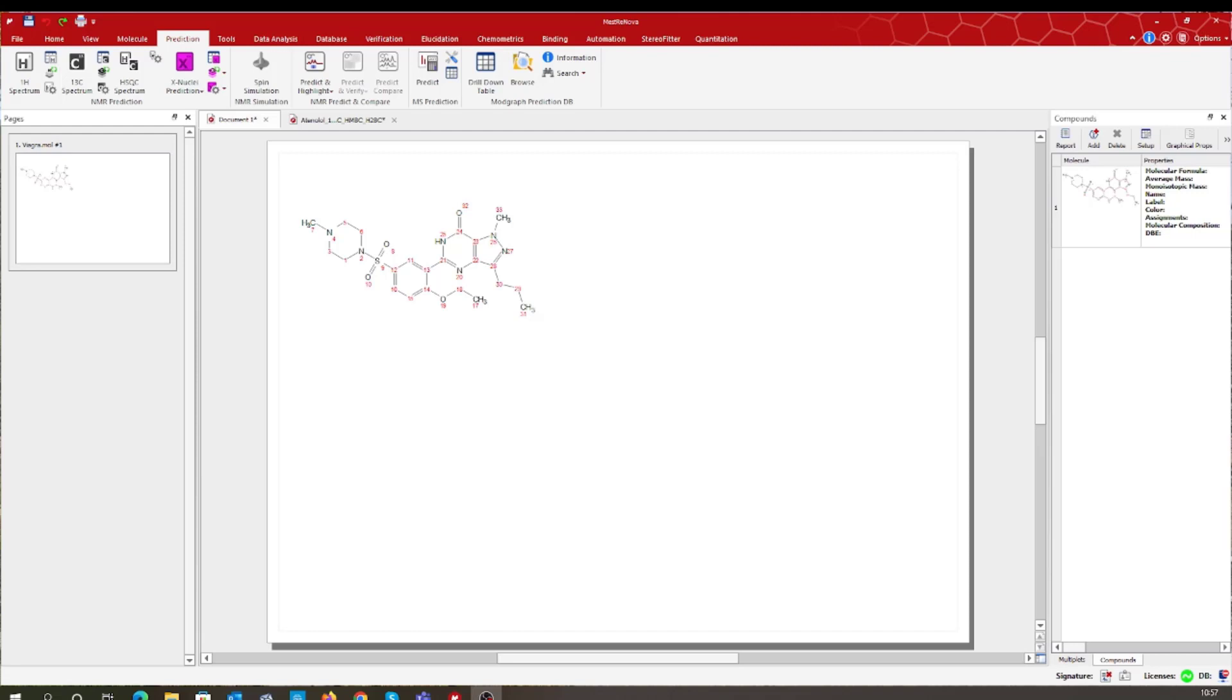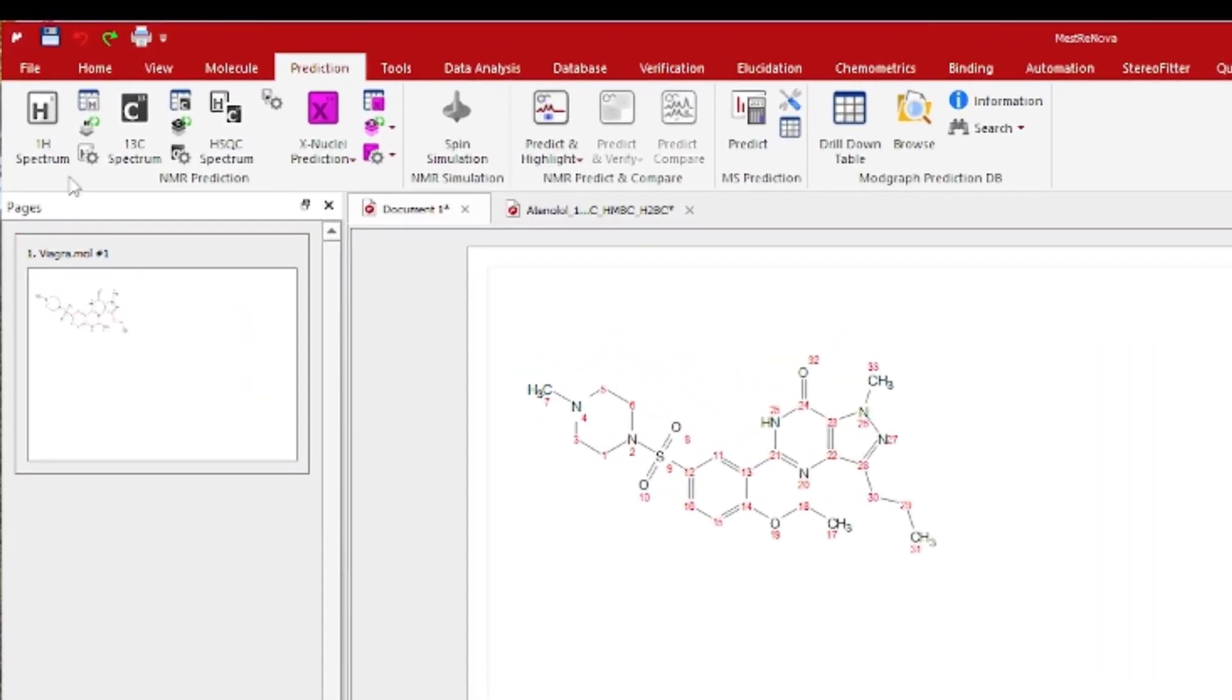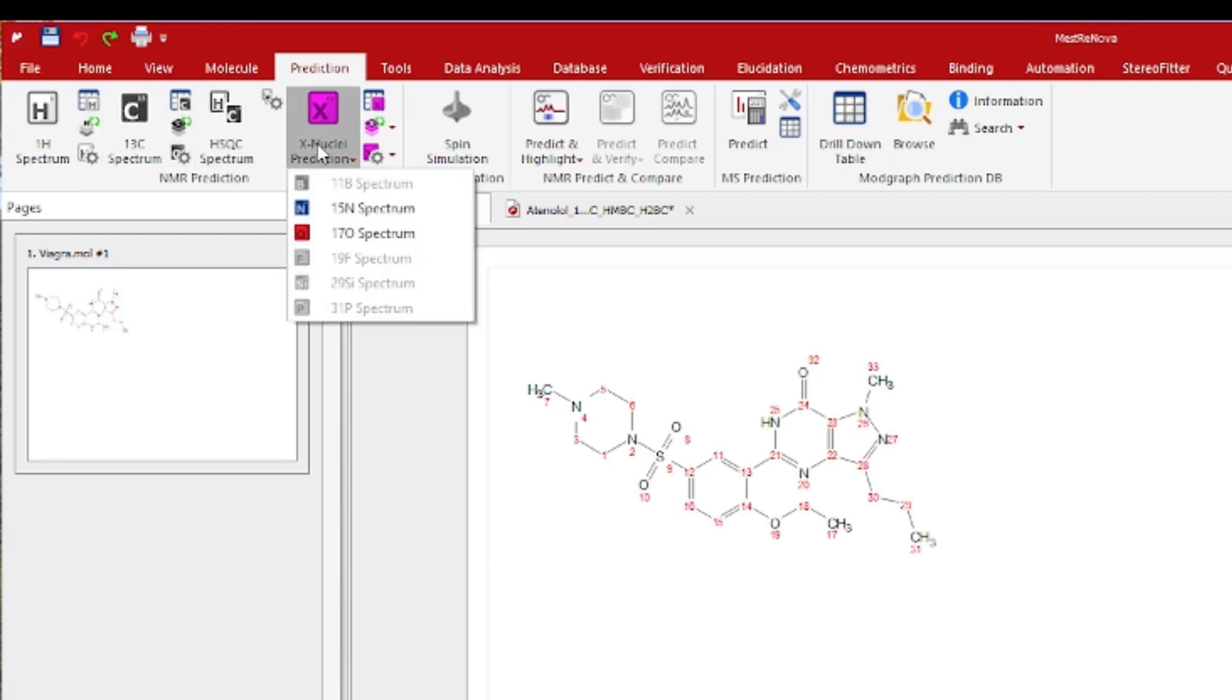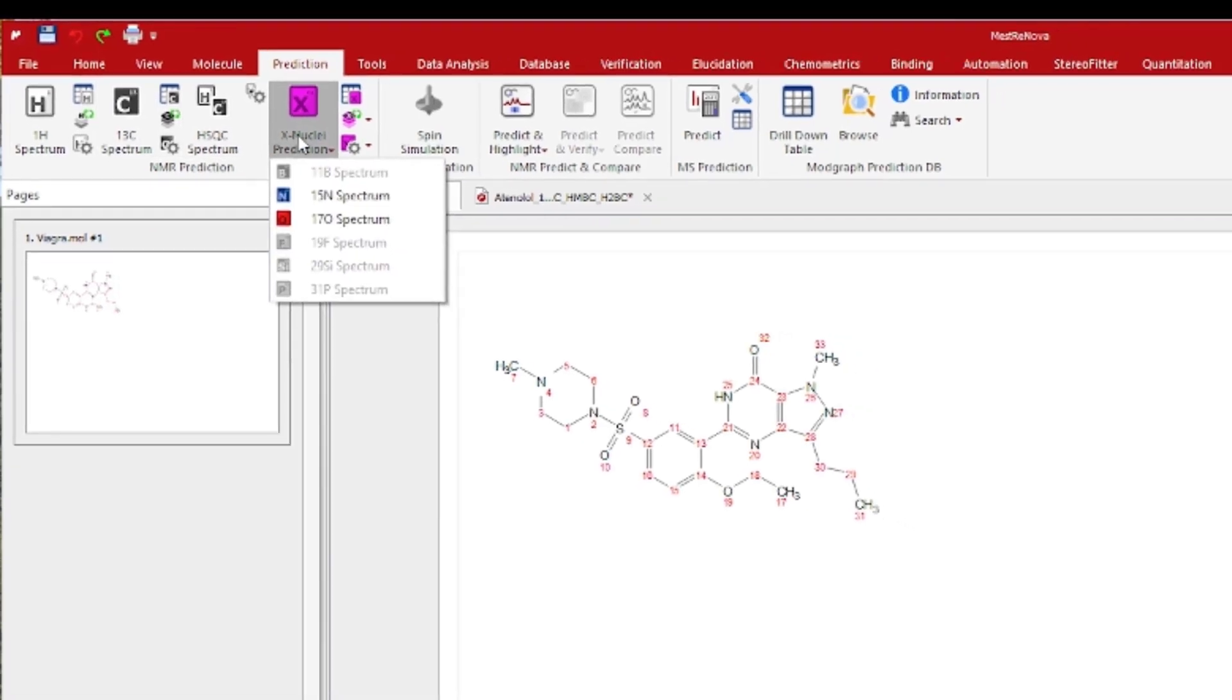This is made possible using our MNOVA Predict plugin which allows users to predict NMR spectra for nuclei such as proton, carbon-13, and any of the nuclei indicated in this list.